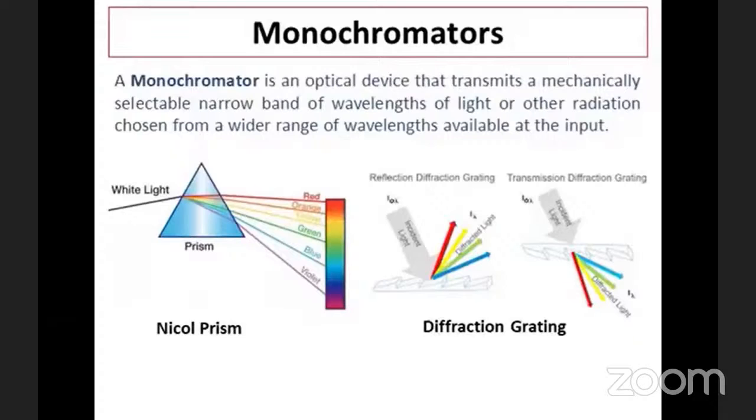If the reflected beam consists of a large number of wavelengths, a monochromator is generally used. It disperses the reflected beam into its individual wavelengths.